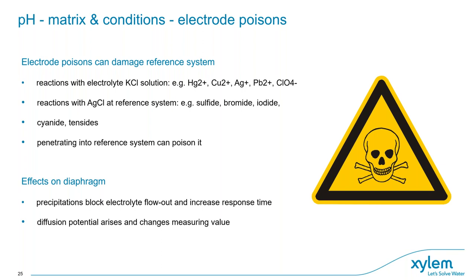So-called electrode poisons can damage the reference system if they get inside through the diaphragm. They reach the silver/silver chloride reference system via the electrolyte and react with it, causing wrong measurements or even permanent damage to the reference system. To avoid this, any solution from outside must not flow into the reference chamber. Therefore, the electrolyte level inside must always be higher than the sample level outside — ensuring flow out and not flow in.